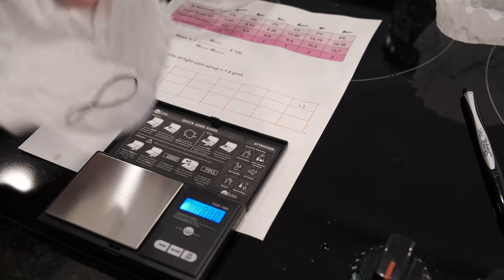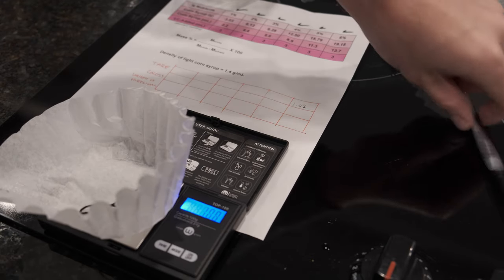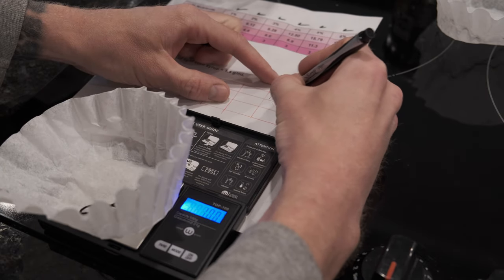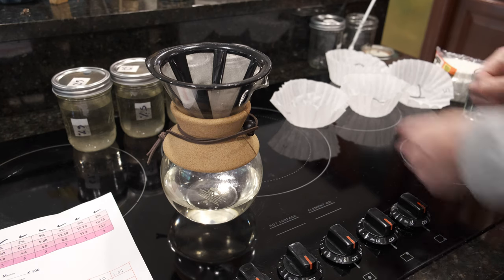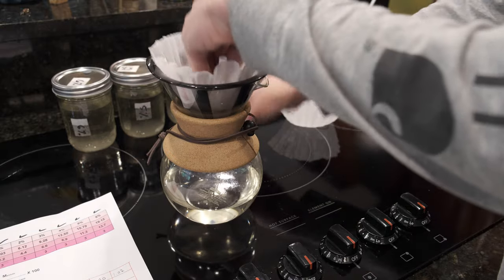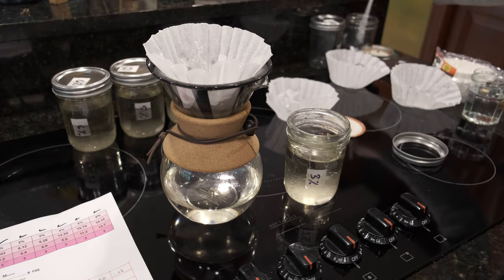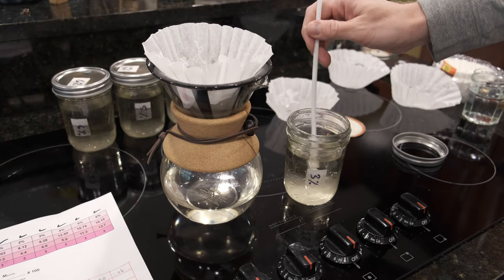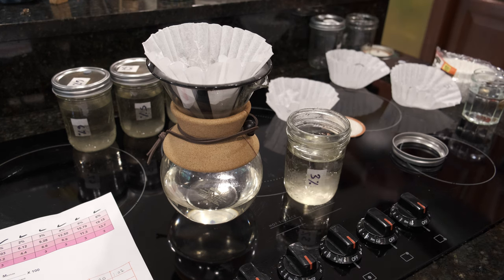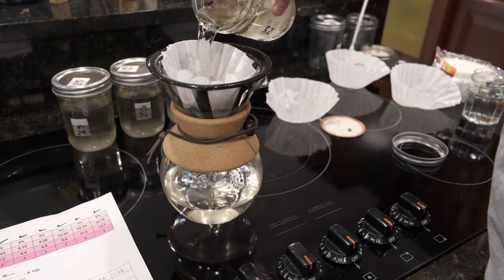I labeled six coffee filters and weighed each coffee filter with its string to get a tare weight. I bet you can guess what I'm going to use these filters for. I'm going to use my coffee filter and my coffee maker to strain the mycelium out. It's pretty redneck, but the lab equipment needed to do this with photospectroscopy or whatever is way too expensive — I don't have hundreds of thousands of dollars to buy that kind of stuff, so I'm just going to use a coffee maker.